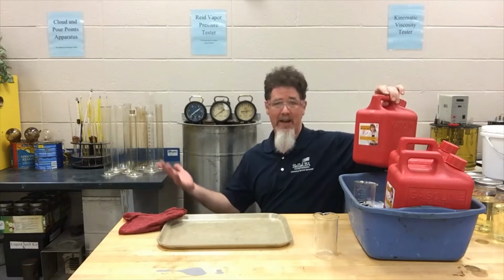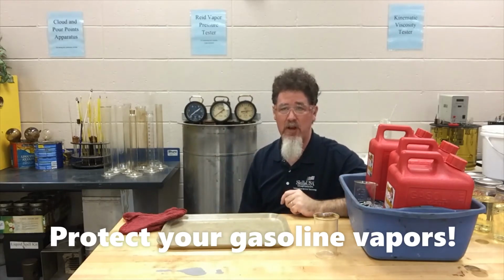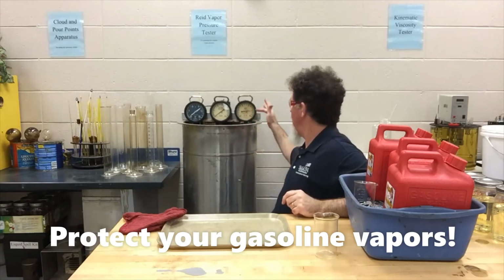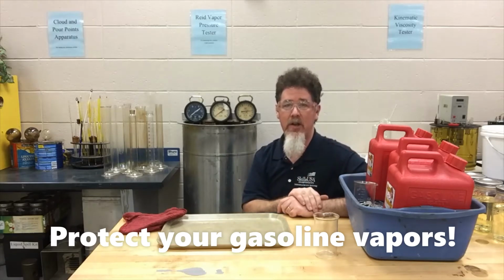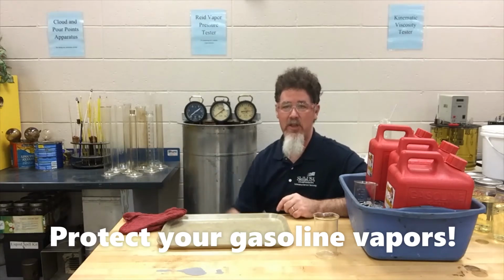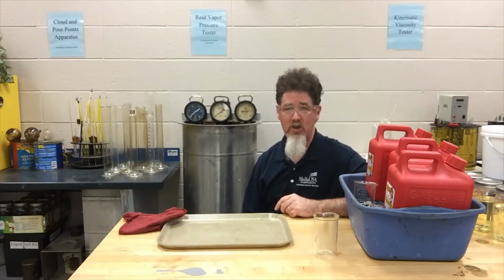Or even this guy right here is sitting out in the hot sun in the back of a pickup truck or something like that, and every time you open it, you're hearing those vapors escape. Well, how much of those vapors are actually escaping? So what I'm doing is I like to do a test point where I'm actually able to see what the Reid vapor pressure is on a brand new sample of fuel that I got today, write it down, and then do some other testing with it to see how much of those vapors I lose. Because as I lose those vapors, in the wintertime, it's definitely going to be harder to start my vehicle or the lawnmower or the chainsaw or something like that.